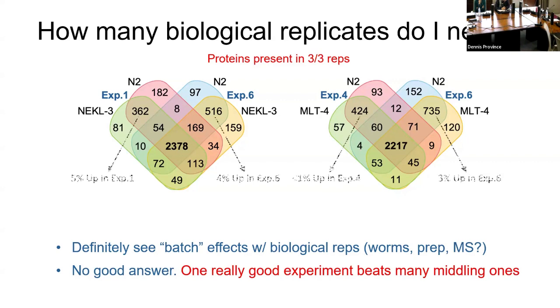and the other day it gets a few more proteins. What I can tell you is that these proteins here, you don't really care about anyway, because it turns out they're really not the things that end up making your list of upregulated proteins. So even though it's a little weird to see this batch effect, or whatever you want to call it, it's probably not going to affect your final list.